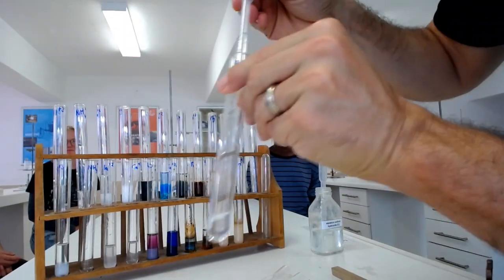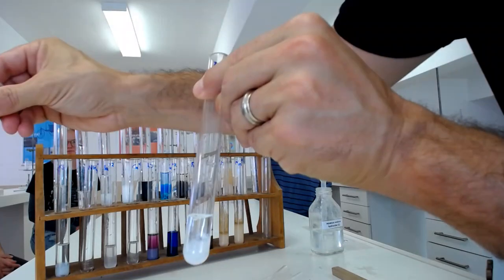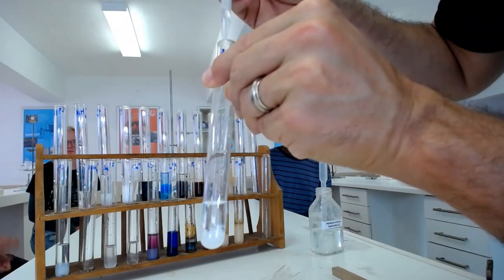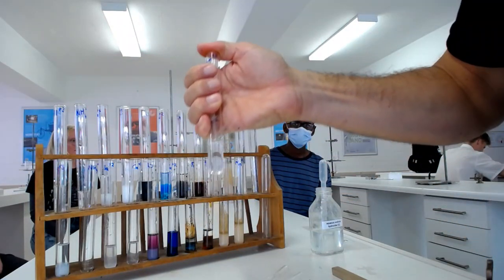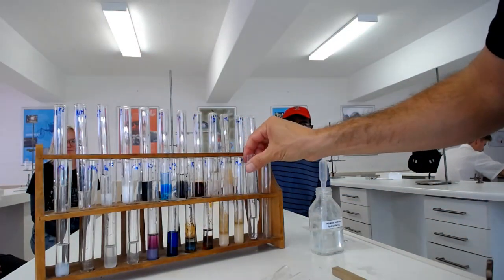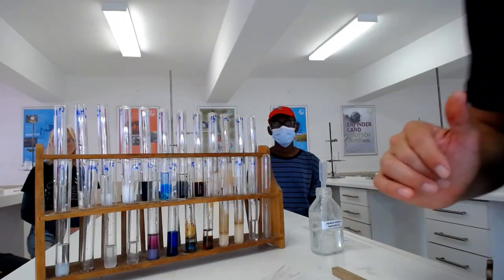Right, what about zinc with ammonia? Same. So white precipitate, as I add more, it becomes soluble. Okay, so that's fine. And those are my cations. There's just 2 questions, the barium and the magnesium. So we'll just have a look at that.